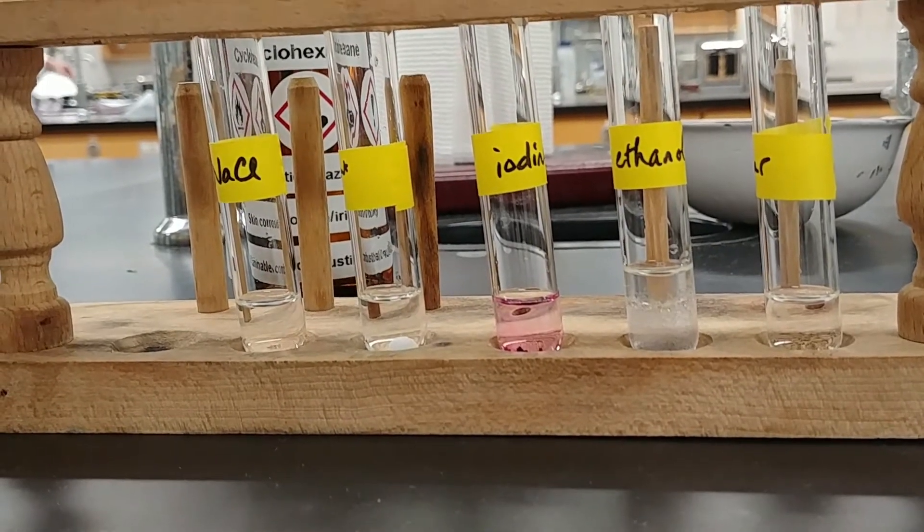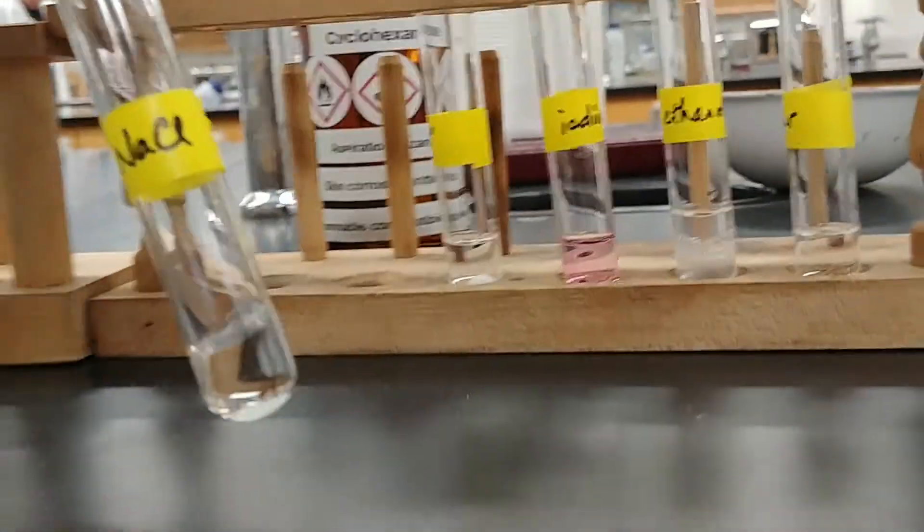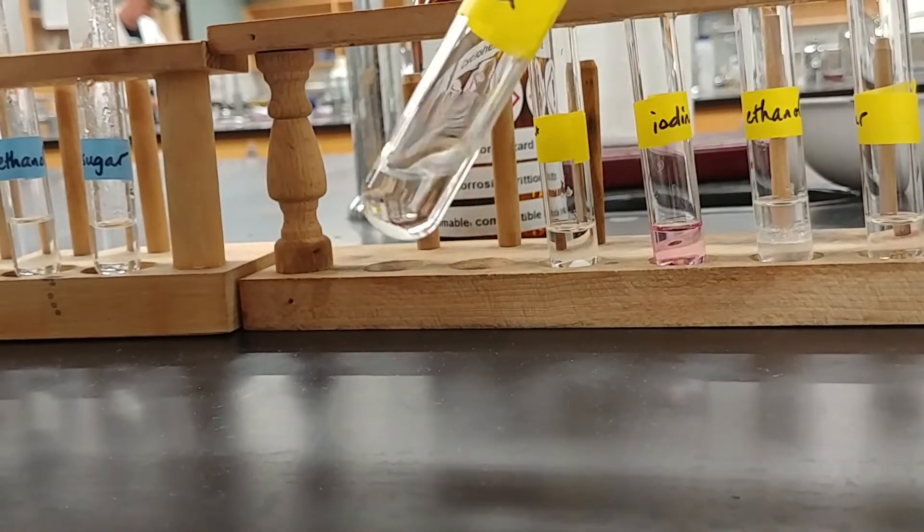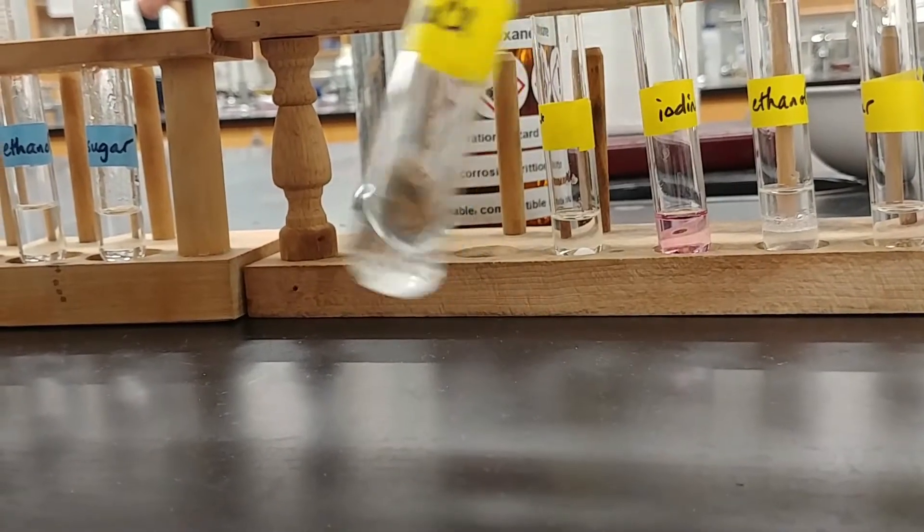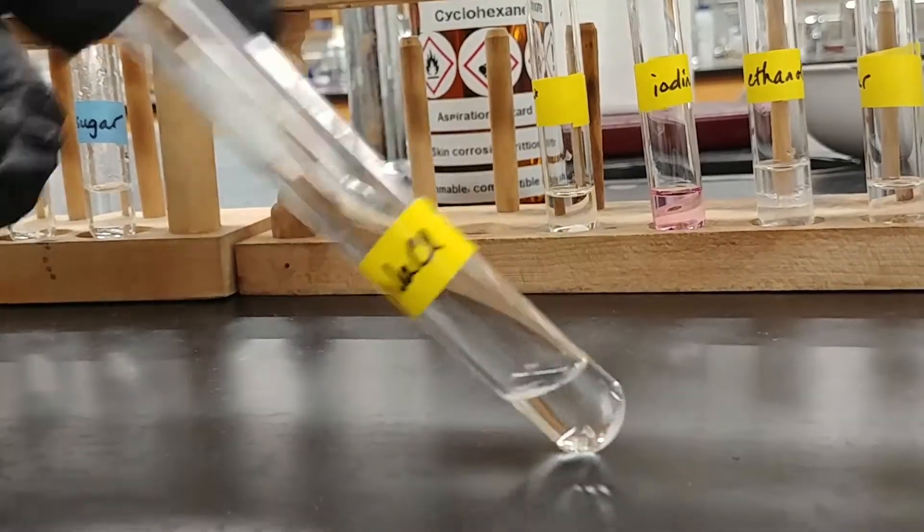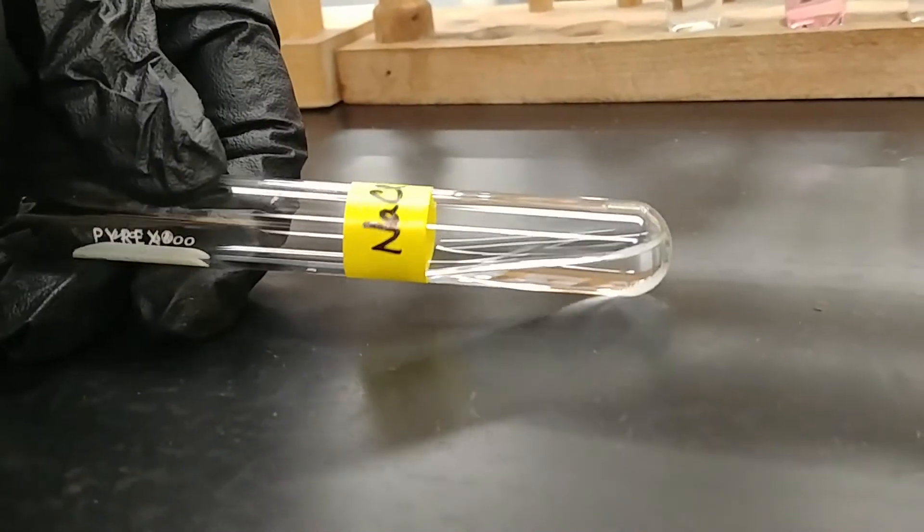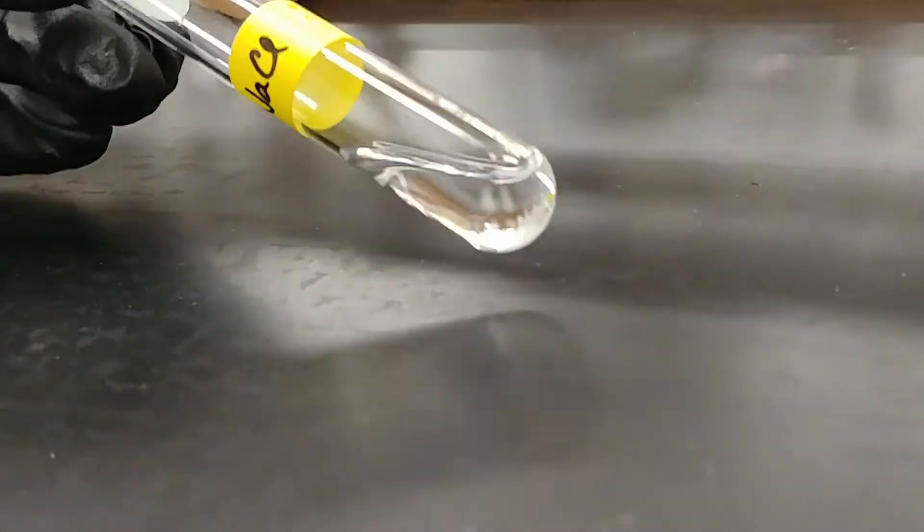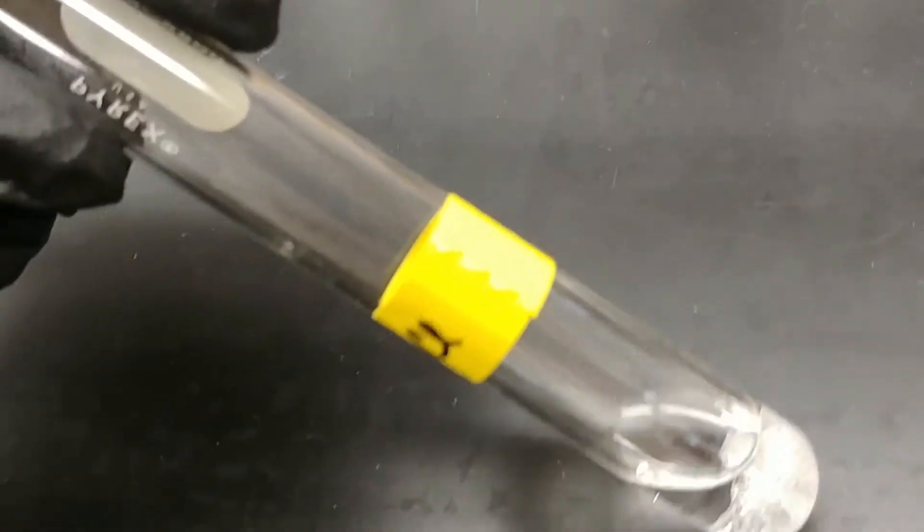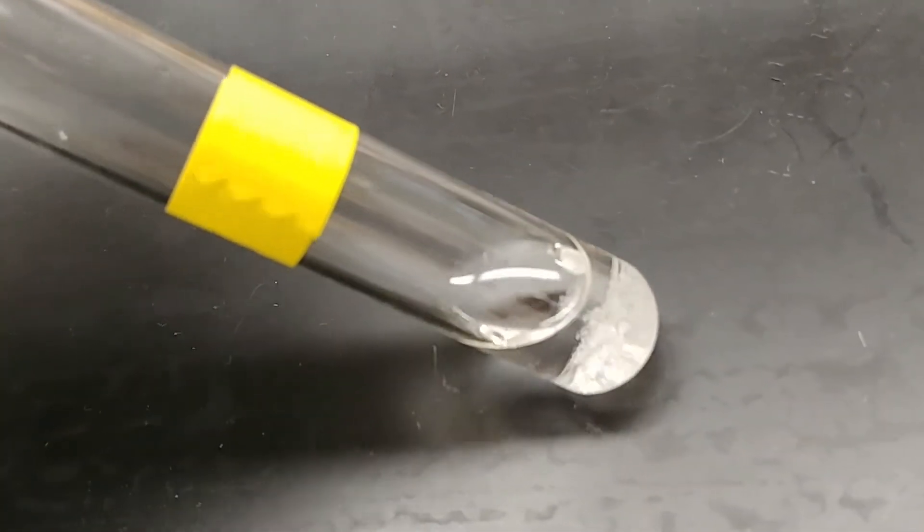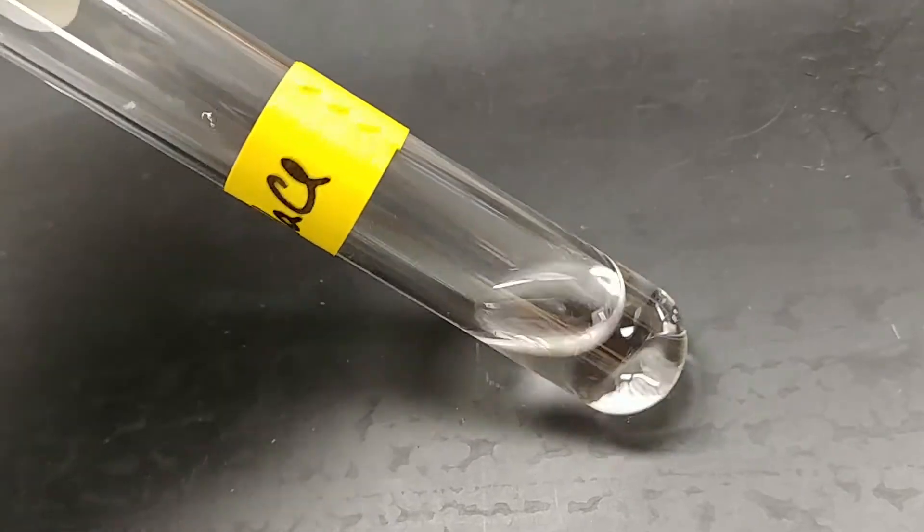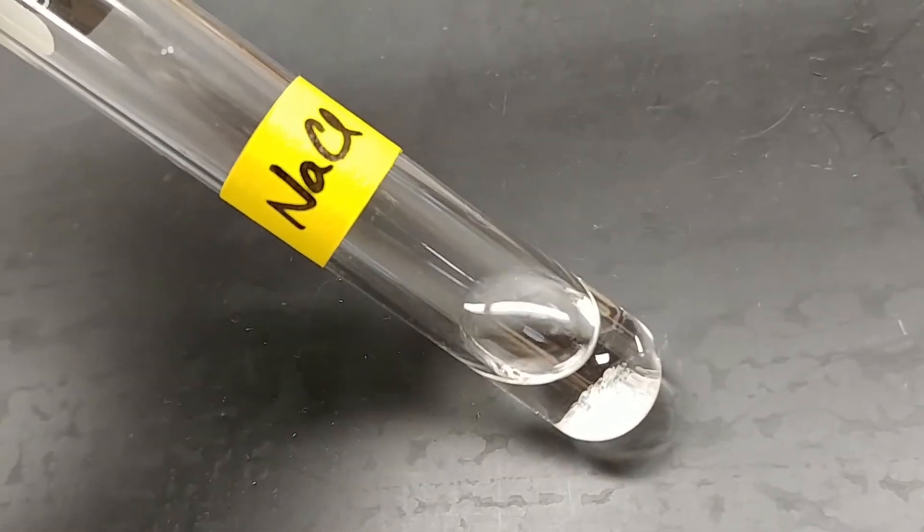So these test tubes that I have marked in yellow, I've added the cyclohexane solvent to our solutes. This was the sodium chloride. Now take a close look, see what you can see in terms of the solid. We may even pan up above a little bit so you can see what's going on in that test tube. So again, this is the sodium chloride and the cyclohexane.